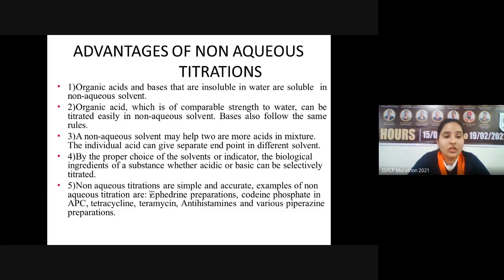The third advantage of non-aqueous titration is that a non-aqueous solvent may help two or more acids in a mixture.